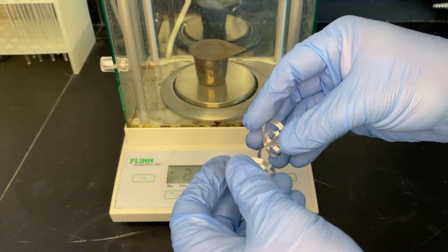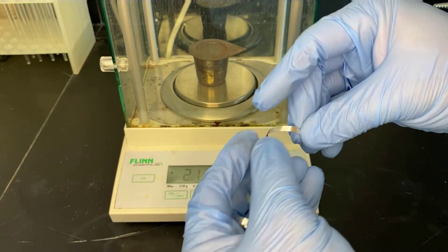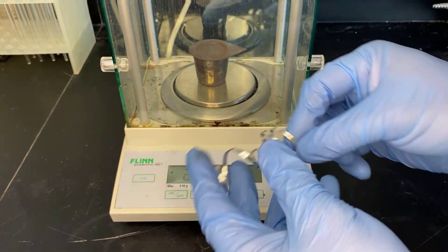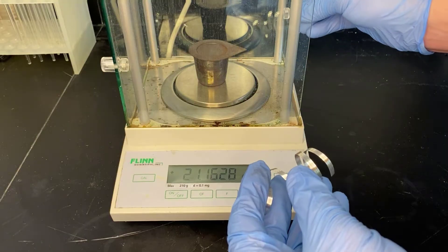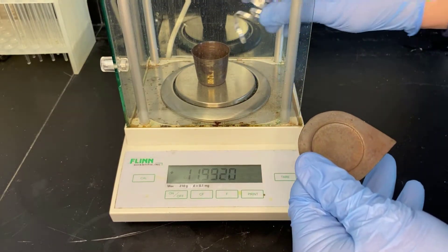That means that some of it's going to get onto the lid. We're going to coil it up and put it inside the crucible and lid, hoping that there will be enough air around all of the different parts of magnesium that we get a nice reaction.